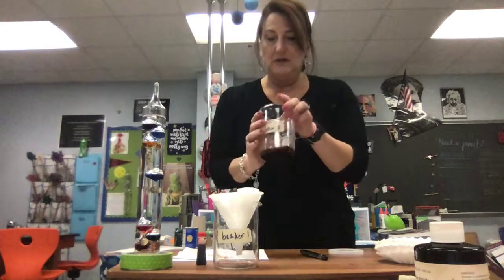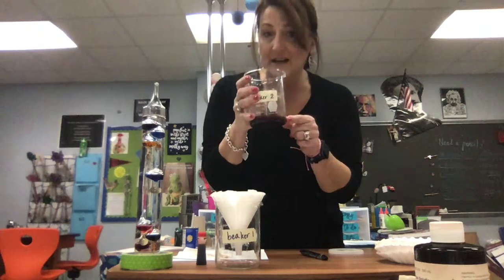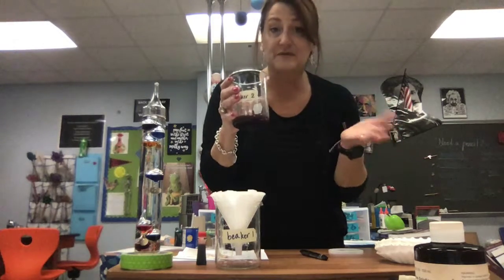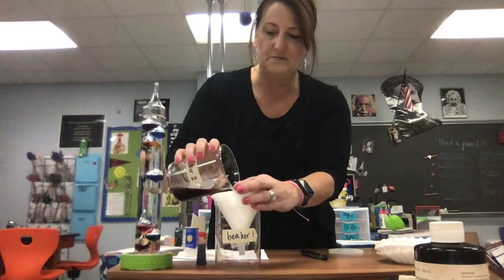Now I'm going to pour this, which, remember, think about what this is representing. Remember, it's a model, so it's not going to be a perfect representation. It's a simulation. I'm going to pour this through and we're going to see what happens. So take a look at what this looks like now.